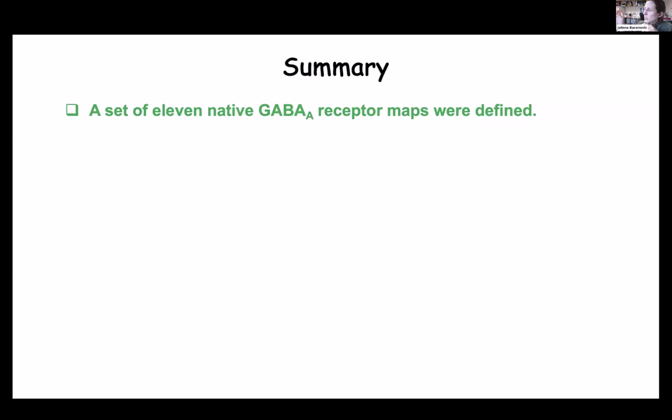Yeah. So just while we're talking about the purification, the aggregate peak that you see after, I don't remember whether it was affinity or size exclusion column, size exclusion probably, does that contain a lot of GABA receptors? It contains some. Yeah, GABA receptor kind of aggregates.